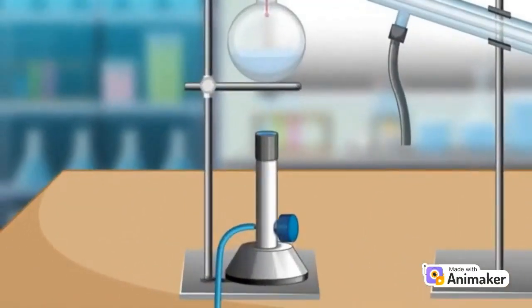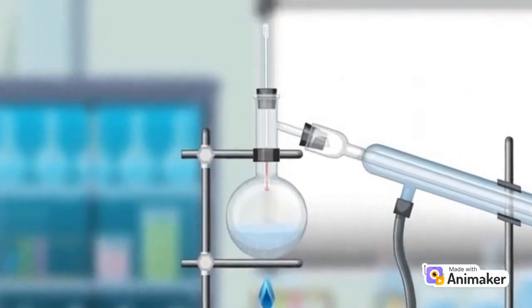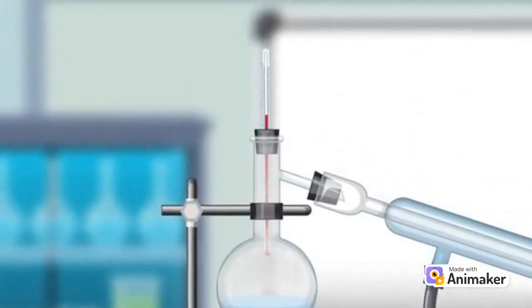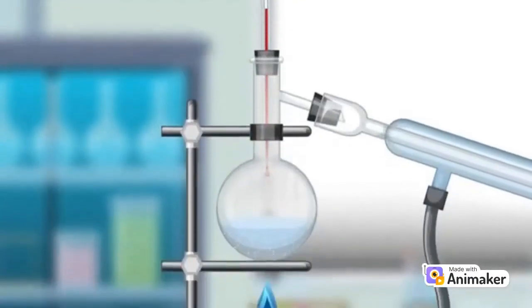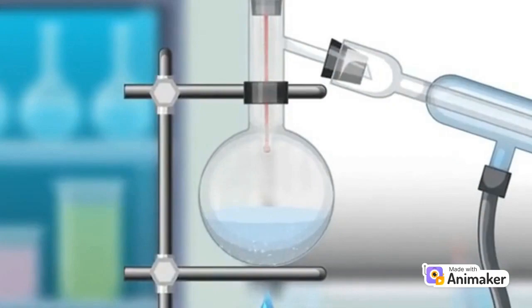Step 3. Heat the substance. The burner is used to heat the substance we wish to distill in the distillation flask. As the temperature rises, keep an eye on the thermometer to monitor the boiling point of the substance. Step 4. Vaporization. As the substance is heated, it evaporates, and the vapor rises in the distillation flask.